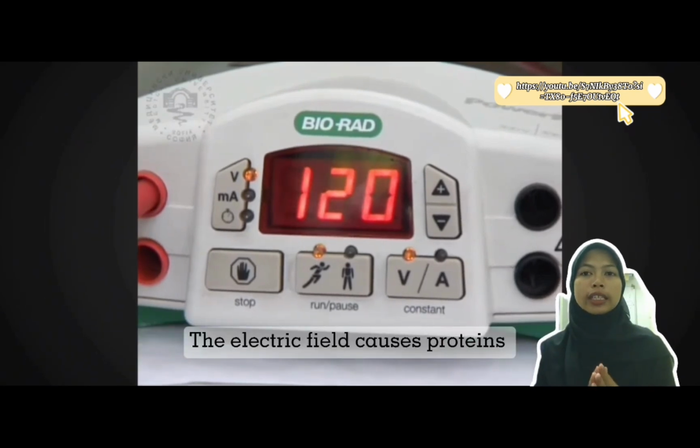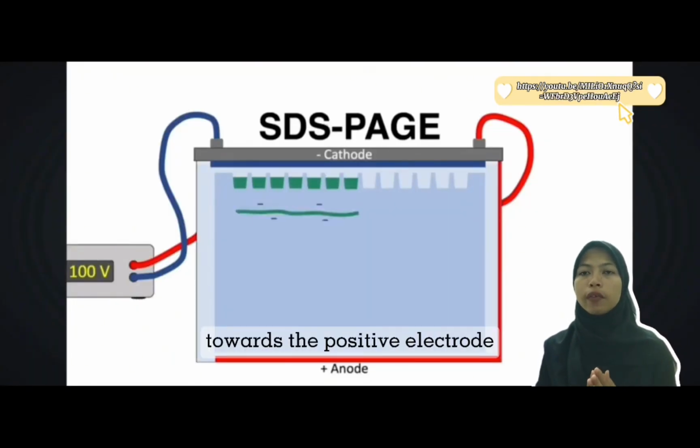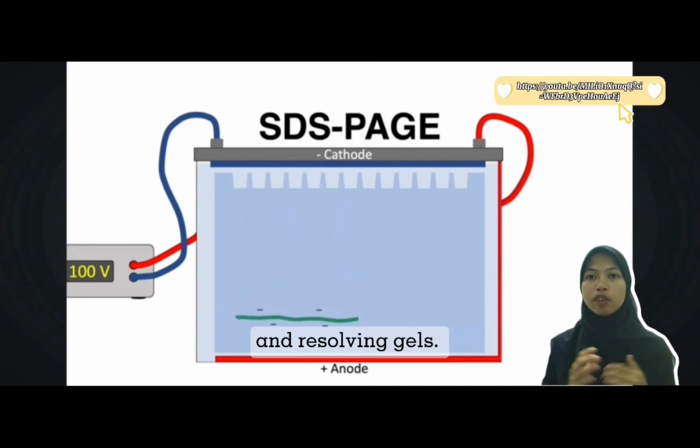The electric field causes proteins to migrate from the negative electrode, which is the cathode, at the top, towards the positive electrode, which is the anode, at the bottom. In the stacking gel, proteins migrate freely and accumulate at the interface between the stacking and resolving gels.